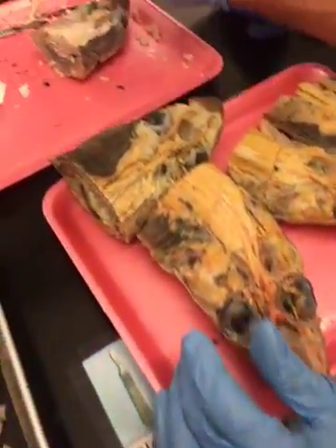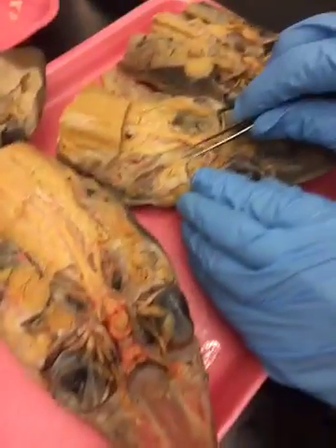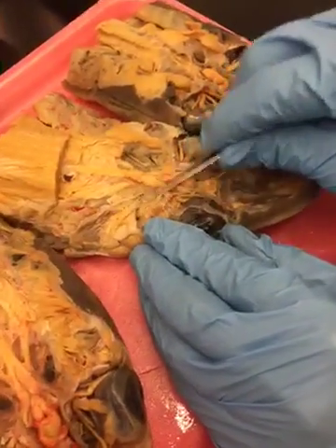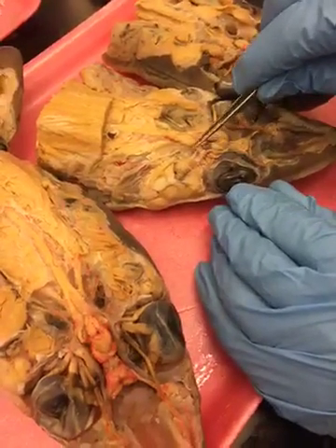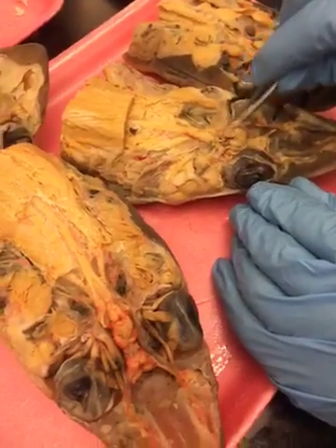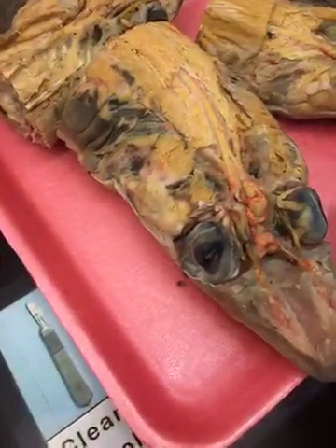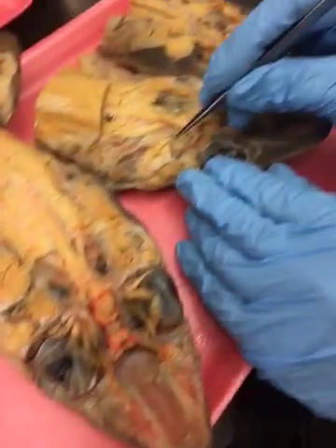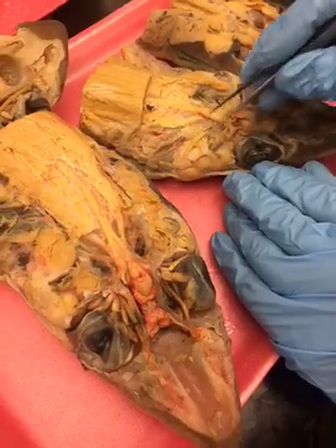Now, running behind it, therefore, somewhere is the hyomandibular branch of 7. And here it is, beautifully dissected on this guy here. There's the spiracle, and there is the hyomandibular branch of 7. Now, to get to that, we had to remove the inner ear, which is up here. So this guy, which still has an inner ear, you don't see the hyomandibular branch. So again, running behind this half gill called the spiracle is the hyomandibular branch of 7.